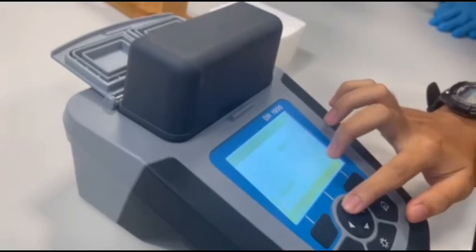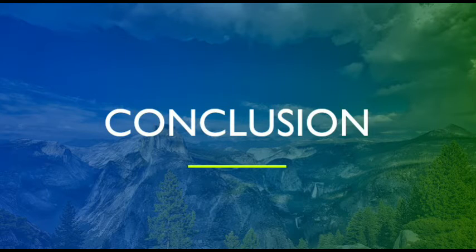over the total volume. The BOD test, biochemical oxygen demand, is a measure of the oxygen used by organisms to decompose the waste. BOD is a chemical procedure for determining the rate of uptake of dissolved oxygen by biological organisms in a body of water that use up oxygen. It is not a precise quantitative test, although it is widely used as an indication of the quality of water.